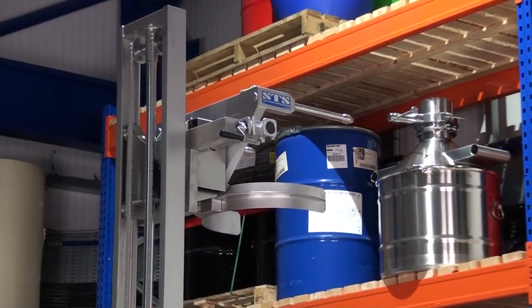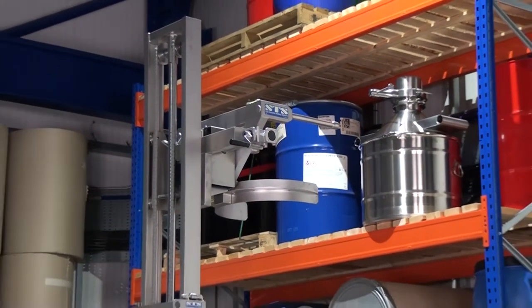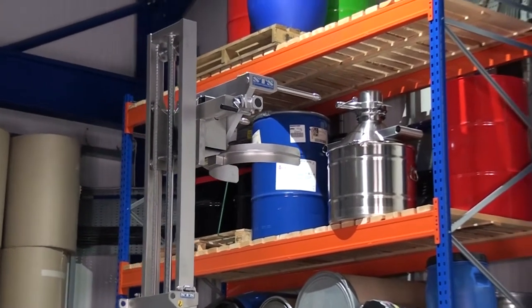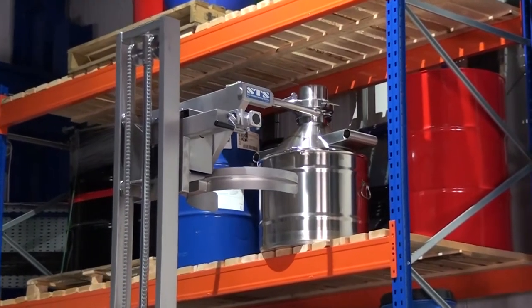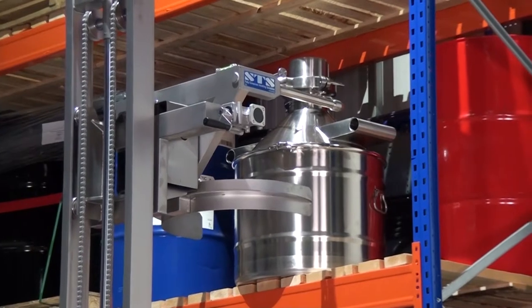We'll show you lowering and raising now. So if we lower down, raise up, wheel back into the container, keep it nice and straight, get nice and close and then I can see I need to come down on the forks.